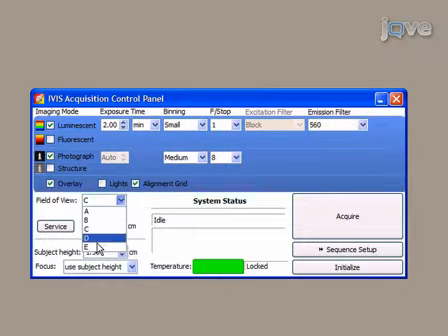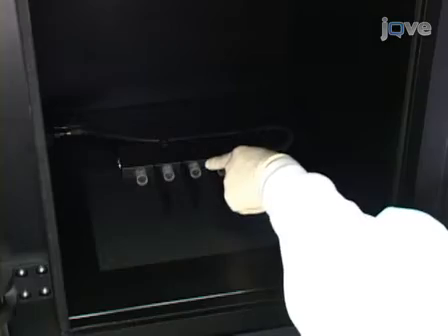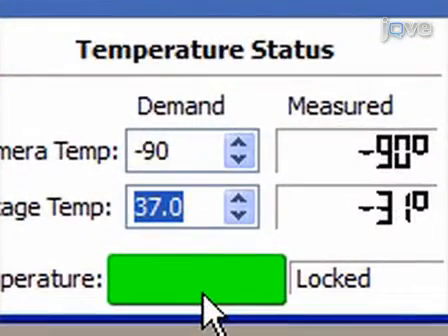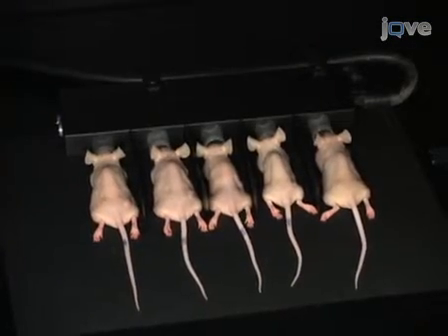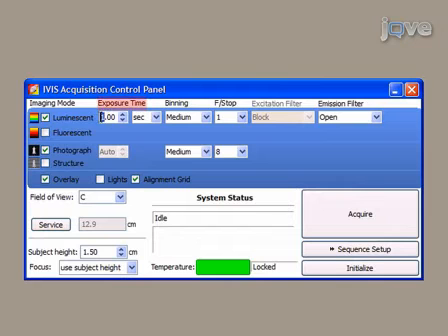Select Field of View for the number of animals being imaged. Up to 5 animals can be maintained in the instrument using the integral anesthetic manifold. The stage is at a constant 37 degrees Celsius to maintain body temperature in the animals. An EKG port is provided to monitor animal health during stressful procedures. In the Living Image software, exposure time, f-stop, and pixel binning can be optimized based on the expression level of the cell line. These settings can be changed at any time during an experiment without impacting the quantitative result.